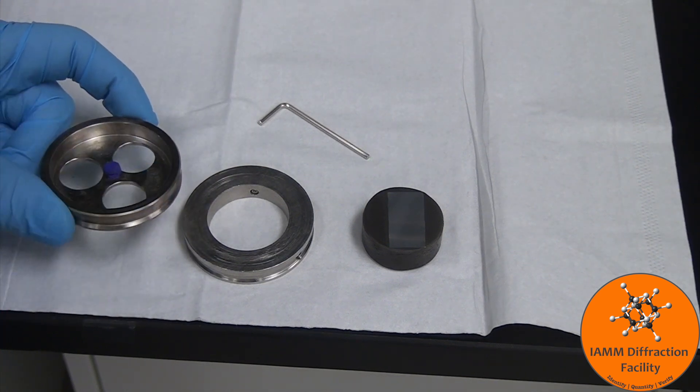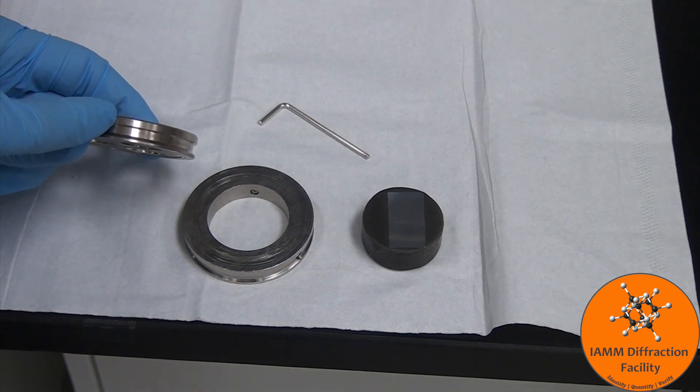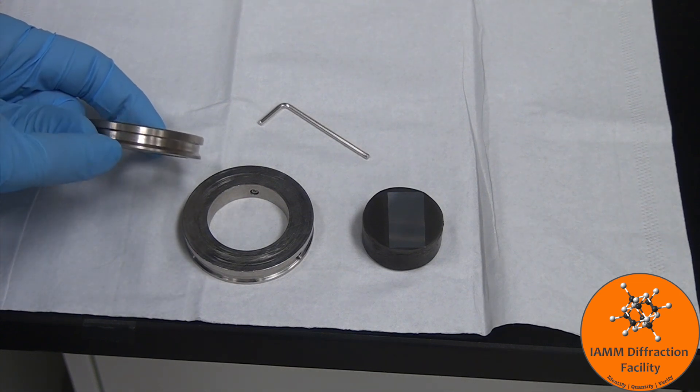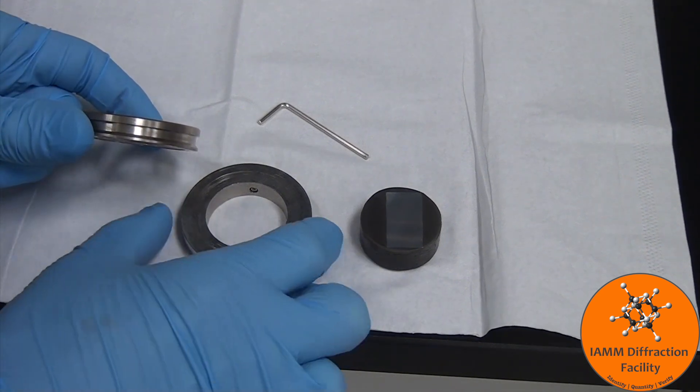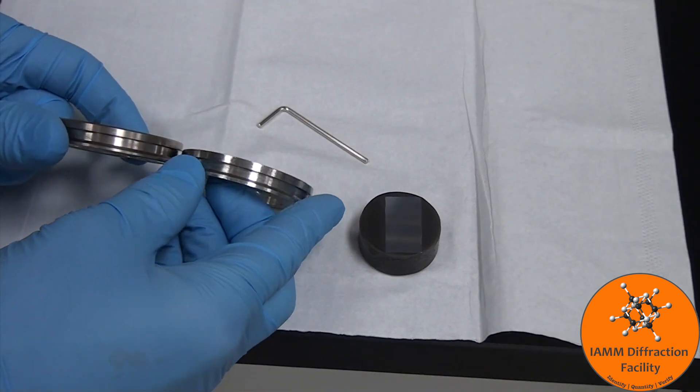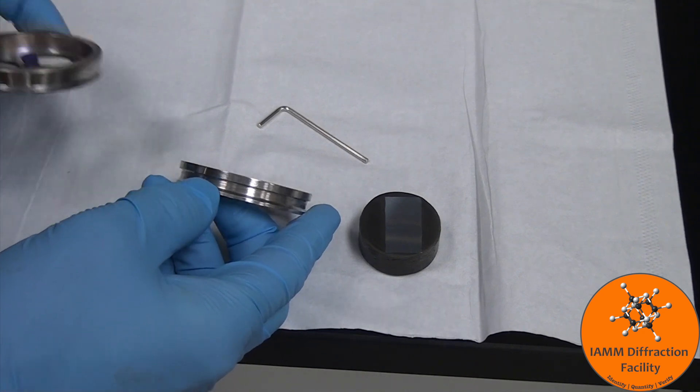This is the top part. And look at that. This has a thicker section up top, thinner section on the bottom. That tells me that this is the upright position for my puck holder.